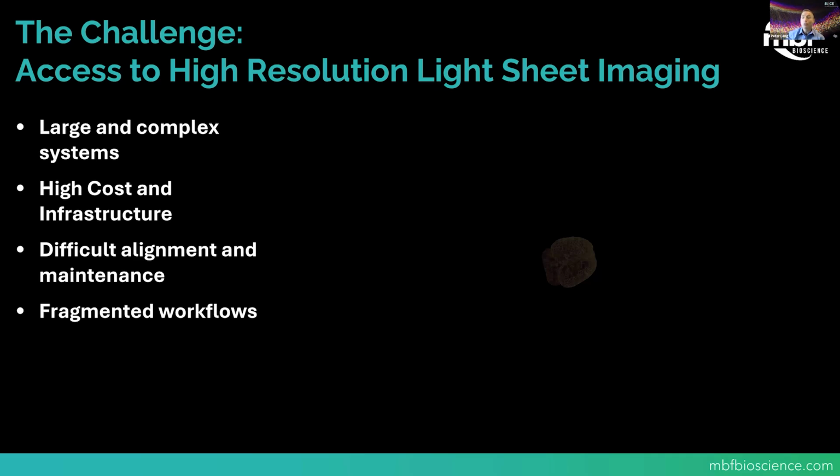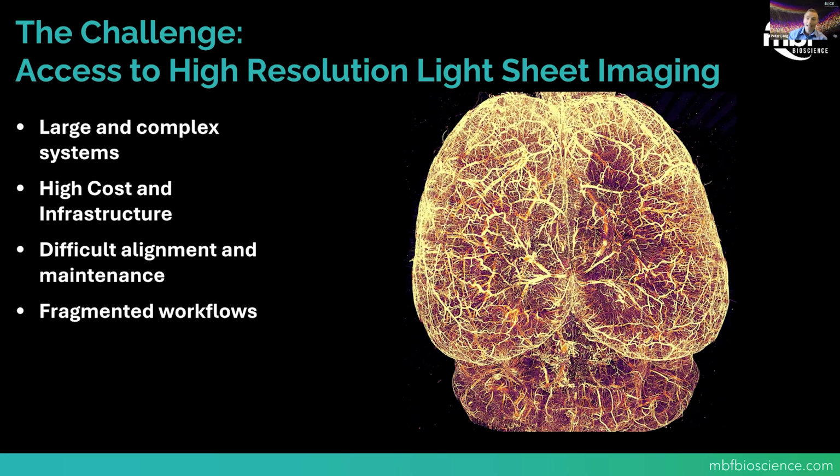SLICE was designed to remove those barriers so even non-experts can generate quantifiable 3D image data sets like the one you see here. This is actually generated by one of our collaborators, Dr. Roger Tomer.